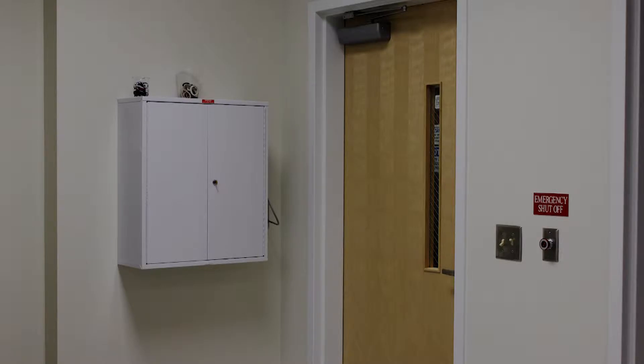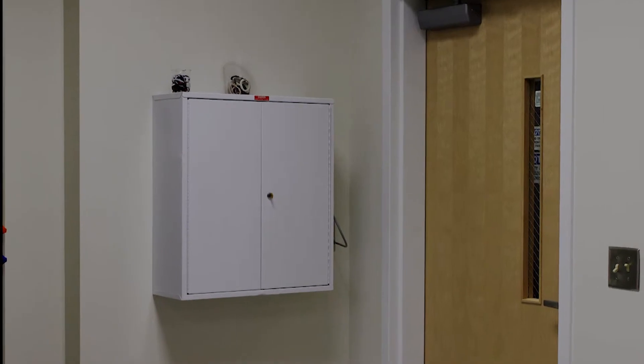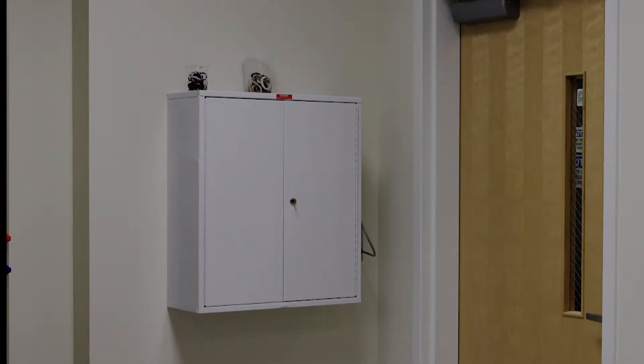The safety glasses cabinet is located by the door you enter the lab through. Safety glasses must be worn at all times while in the lab, even if you're just watching a video or taking a test and no chemicals are out. You may provide your own safety glasses as long as they are ANSI Z87.1 certified. Prescription glasses or sunglasses are not an approved substitute for safety glasses.